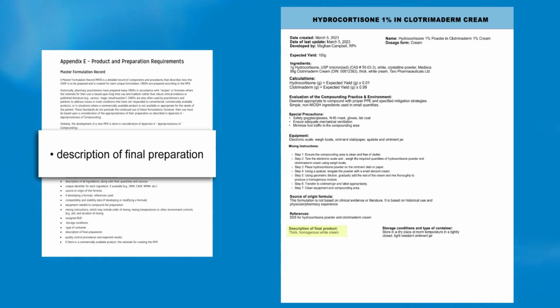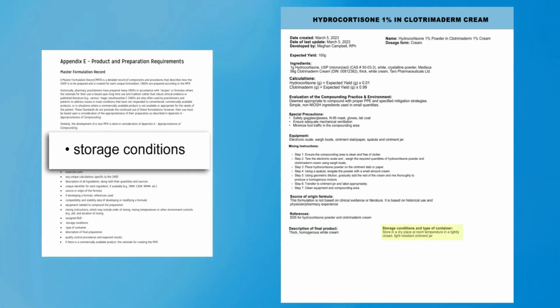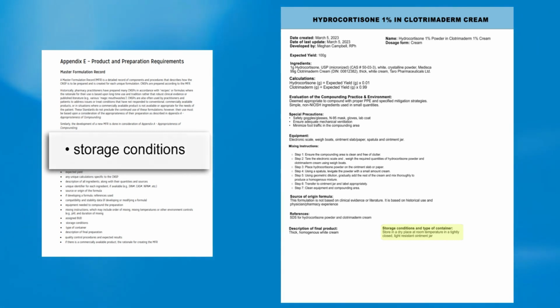A good example of a product that could look different is diclofenac and Diffusimax gel. If a levigating agent is not used, pockets of powder can appear within the cream. When a levigating agent is used, it results in a homogeneous mixture with no visible powder. Storage conditions need to be included and will vary for products, but may include light-resistant packaging, refrigeration, or glass bottles.